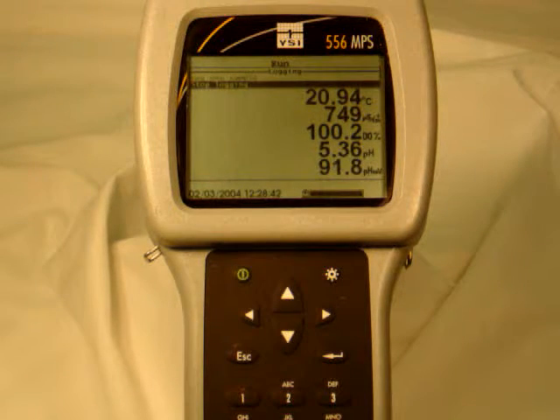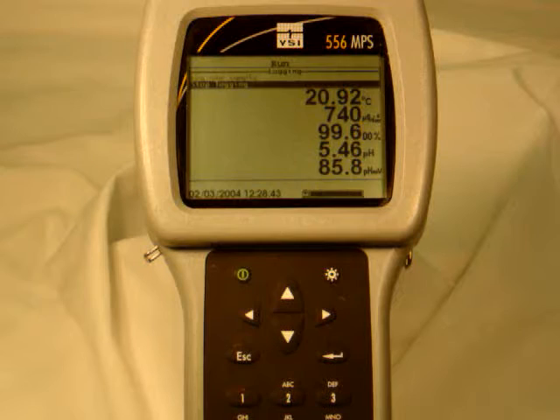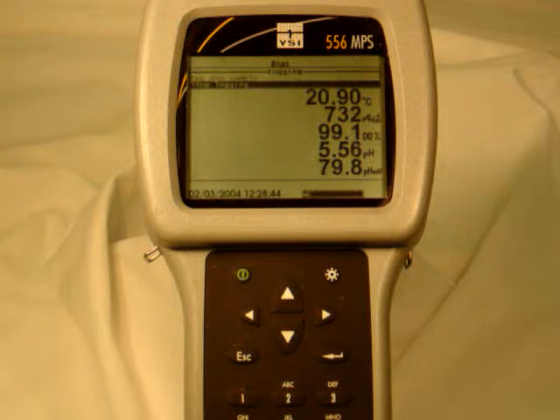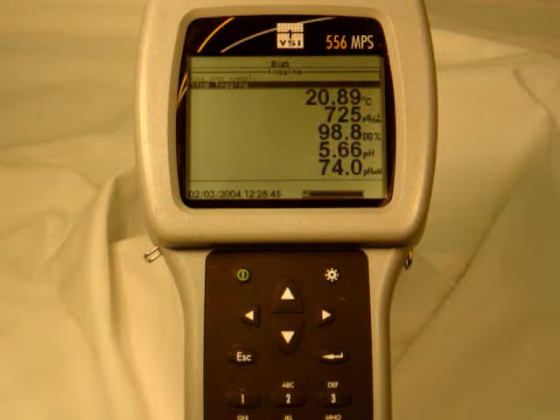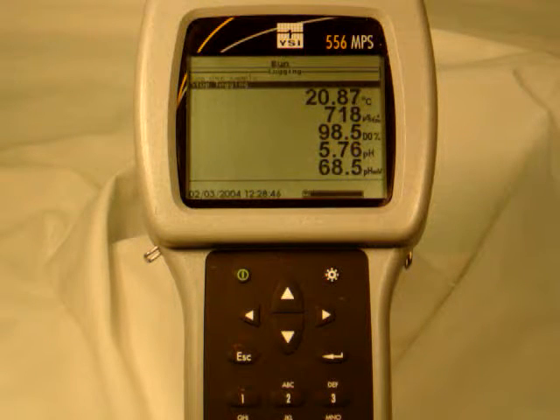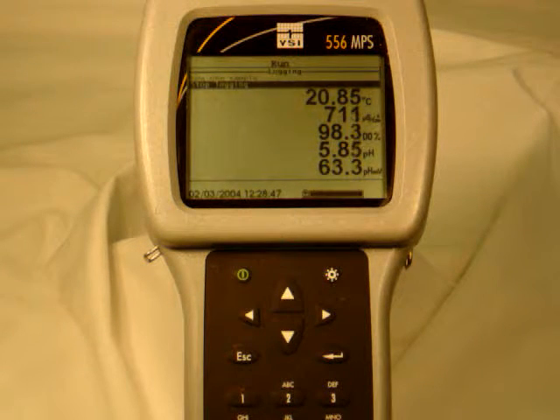What did you do there? You'll see. Don't hit stop until I say stop. You're actually logging it to a file. Yeah, they're going to put up the graph.